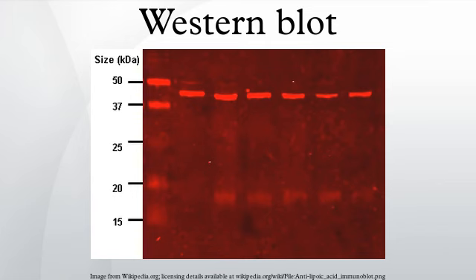A cheaper but less sensitive approach utilizes a 4-chloronaphthol stain with 1% hydrogen peroxide. Reaction of peroxide radicals with 4-chloronaphthol produces a dark purple stain that can be photographed without using specialized photographic film. As with the ELISpot and ELISA procedures, the enzyme can be provided with a substrate molecule that will be converted by the enzyme to a colored reaction product that will be visible on the membrane.